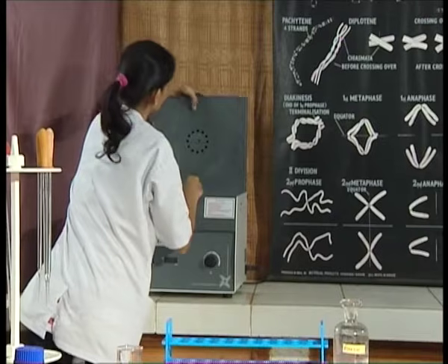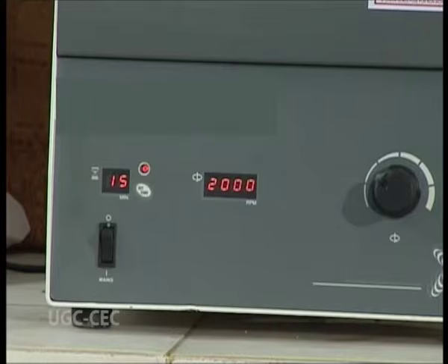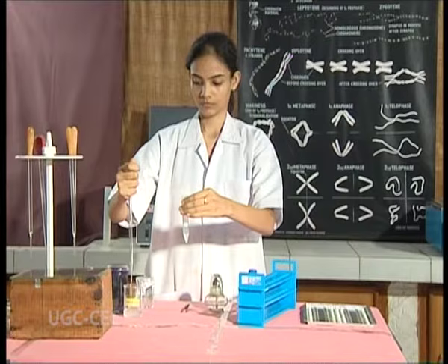Repeat for 2-3 washes of fixative with thorough mixing till the pellet is clear. After the last centrifugation, remove the supernatant.